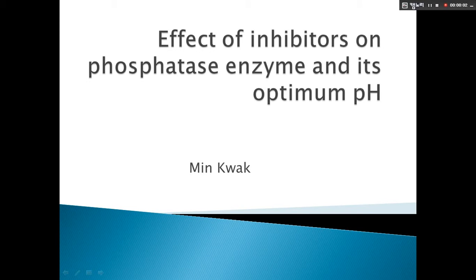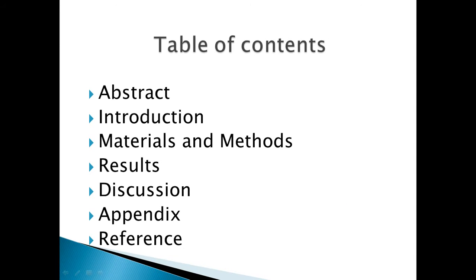Hi, my name is Min, and I'll be talking about the effect of inhibitors on phosphatase enzyme and its optimum pH. The table of contents is as follows: abstract, introduction, materials and methods, results, discussion, appendix, and reference.